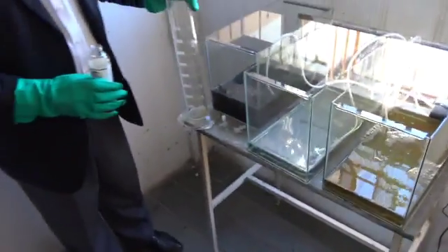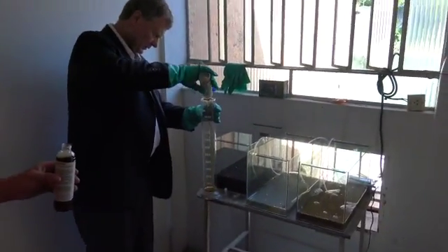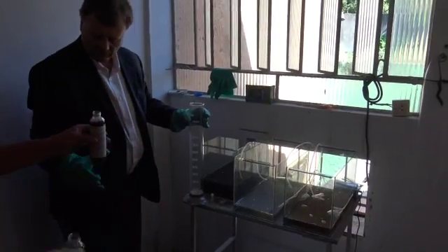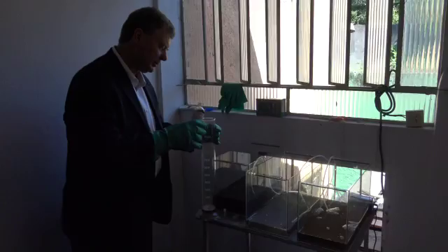We're going to measure this. We're going to apply 100 milliliters in this one, half of what we put in the first one.